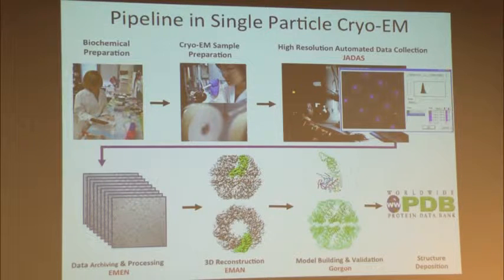In this pipeline, a lot of these steps are highly assisted by data processing. The computer control of the instrument, and the data processing to convert from 2D images to 3D images and eventually build models, are very computationally intensive, more so than traditional X-ray crystallography.